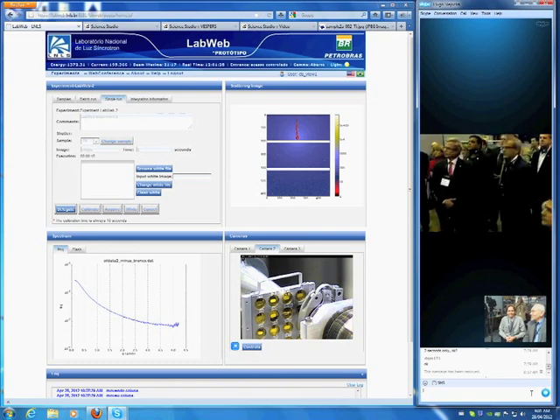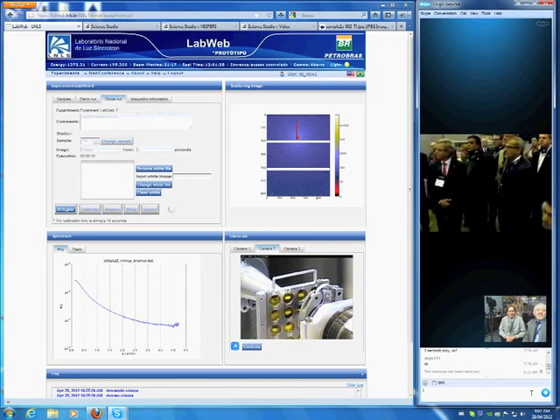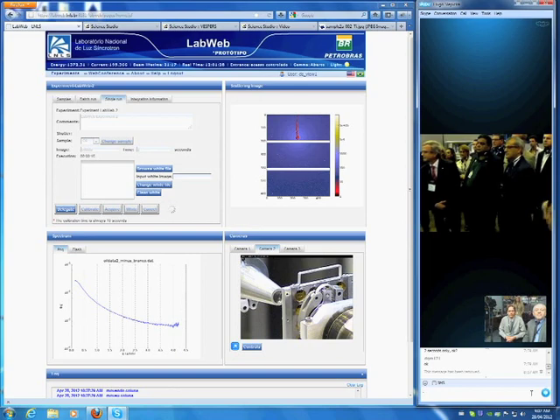So you first choose what you see here, the interception of the area detector on the conical scale. Here we see the intensity of this. And here we have the moving sample, putting it in position to start a measurement. We're doing that from Argentina, and you see now the spectrum coming up. This is a prototype of the system. I will explain later how this works.